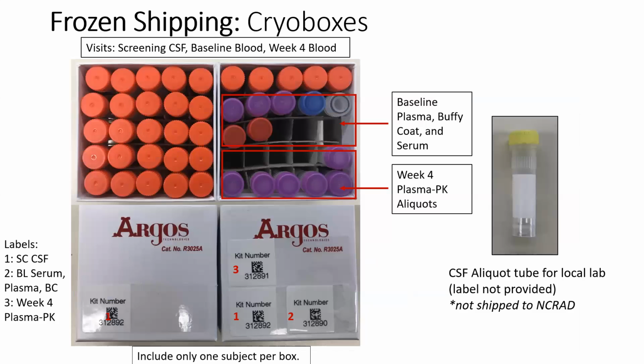So we do ask you to batch ship samples to us. And this could mean batch shipping samples for each patient from different visits. So in this first cryo box schematic, you can see that we have 3 different visits in 2 boxes.